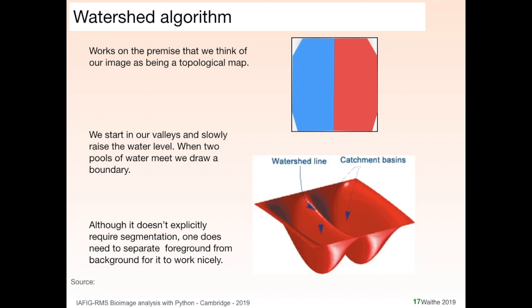So you can imagine this is kind of the idea. What this allows us to do is, using the brightest points as seeds, we can flood fill our image, taking into account how the gradients of the intensities change, like where the steep areas are, and it allows us to create borders between our cells. You might have used the watershed briefly yesterday, and you'll use it again today in the practical. It's a great way of separating images where you thresholded them and you want to find the boundaries between cells that actually touch. So we've got an example here.